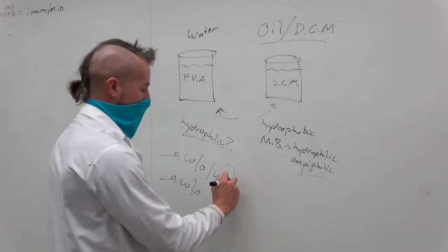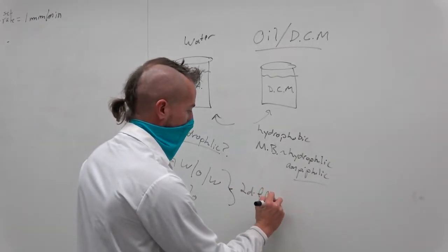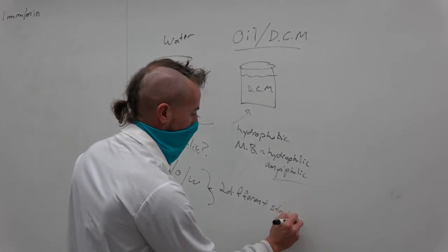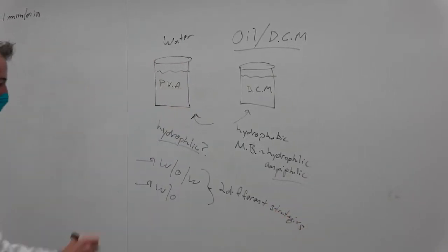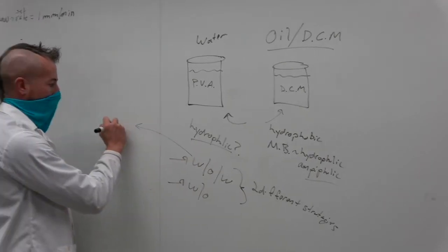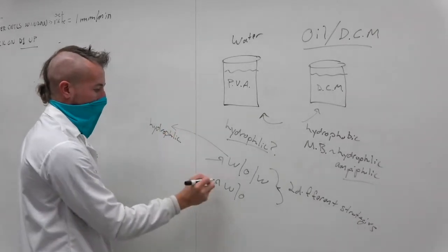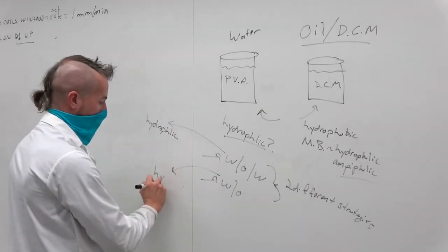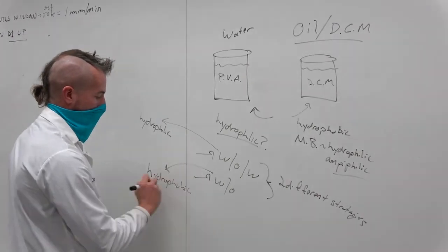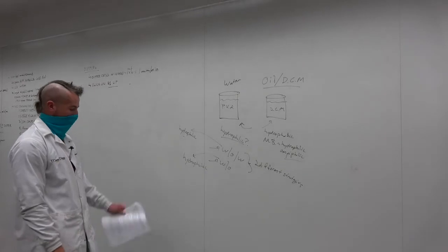Okay? So, two different strategies. This is for more hydrophilic, and this is for more hydrophobic. Okay?